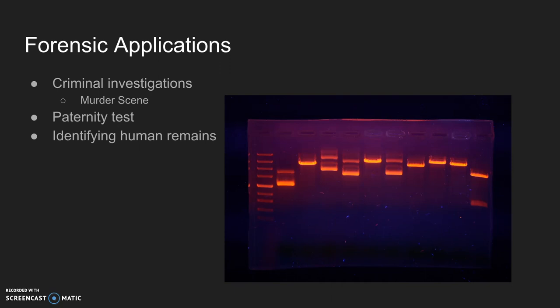At a murder scene, DNA of blood at the scene can be isolated and copies can be made of the DNA fragments. Loaded onto a gel, the samples of different suspects' DNA may then be loaded in adjacent wells, and running the gel will produce different band patterns that can be compared for similarities as seen above.